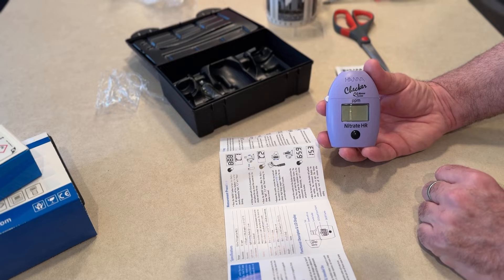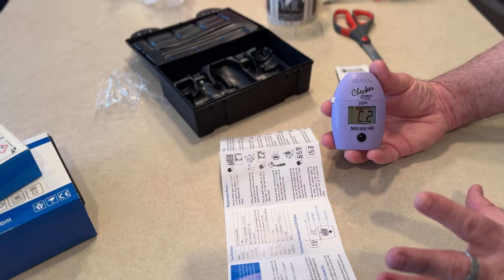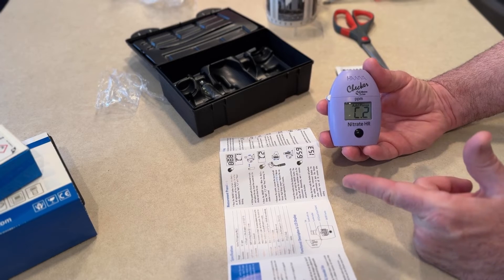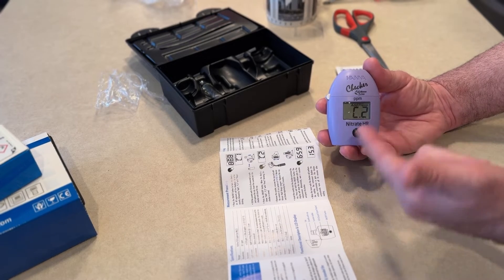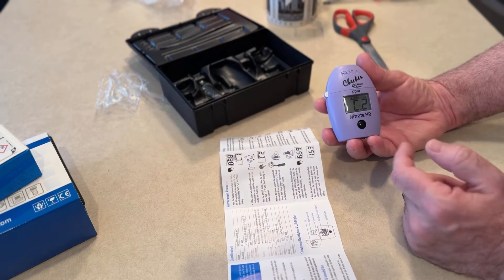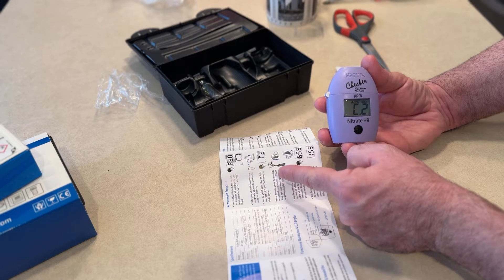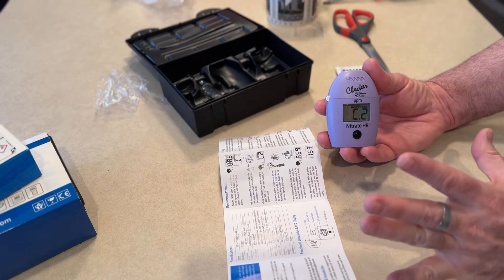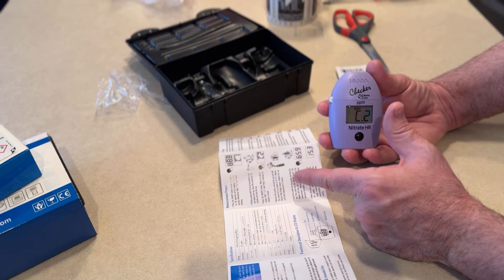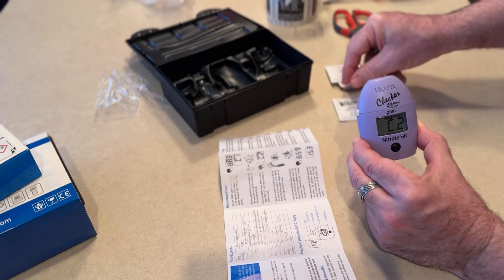One thing about being in the tech field — I write instructions — I want instructions to be clear, because it said nothing about it blinking. It should have shown it blinking in the diagrams. When the display shows 'Add C2' with press blinking, the checker is zeroed — so now it knows what your water baseline is. Remove the cuvette, unscrew the cap, and add the contents of one packet of the reagent. Replace the cap and shake vigorously for two minutes.